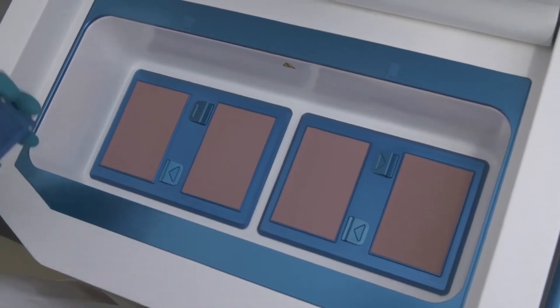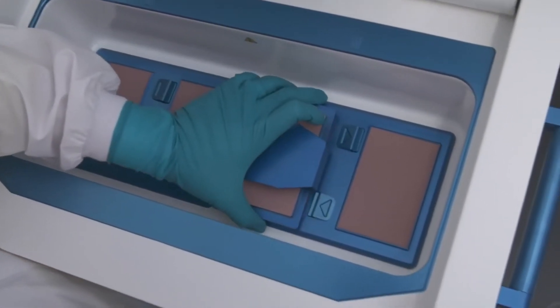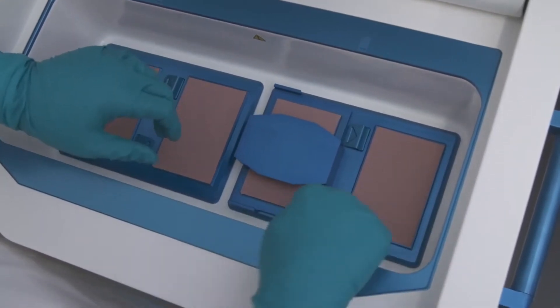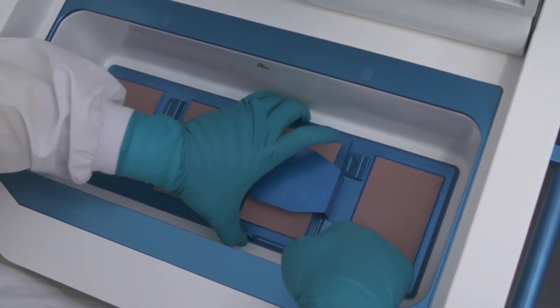To initiate the freezing, you'll take your cassette and place it on one of the panels and you'll see this pop up. To take that panel out after freezing, you'll click the button here and release your panel.